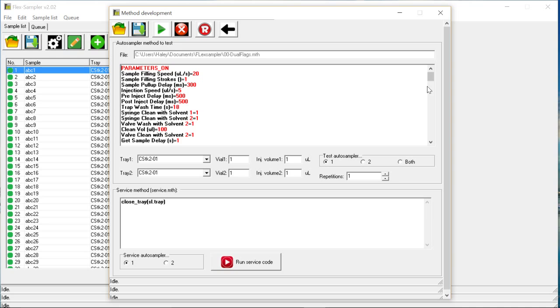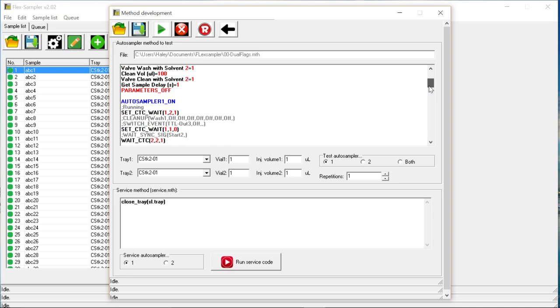You have a list of parameters here, and then if you come down here, we have some basic, it's kind of the equivalent to Cycle Composer. It's really just a notepad kind of method with some variables. Pretty straightforward. If you have Cycle Composer now, you can pretty much import this and be ready to go. The difference here is that we have a lot more flexibility on what we can do.